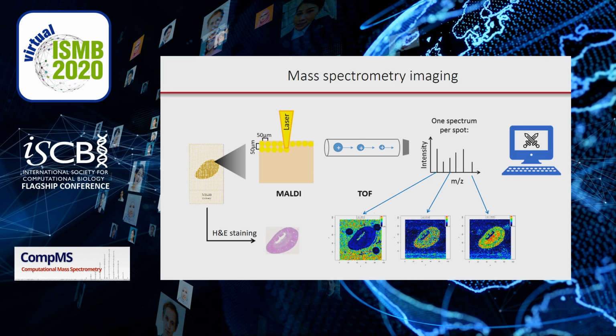MSI data analysis remains challenging due to the large and complex data, missing standardization and accessible software. In most studies, proprietary or license-requiring software as well as in-house scripts are used for the analysis, which hinders accessibility and reproducibility. Existing open-source software that paves the way for reproducible data analysis often requires steep learning curves for scientists without programming knowledge and sometimes lengthy installation of software.